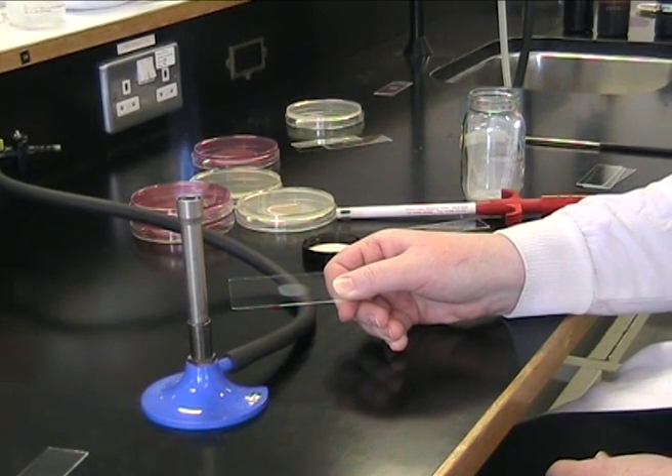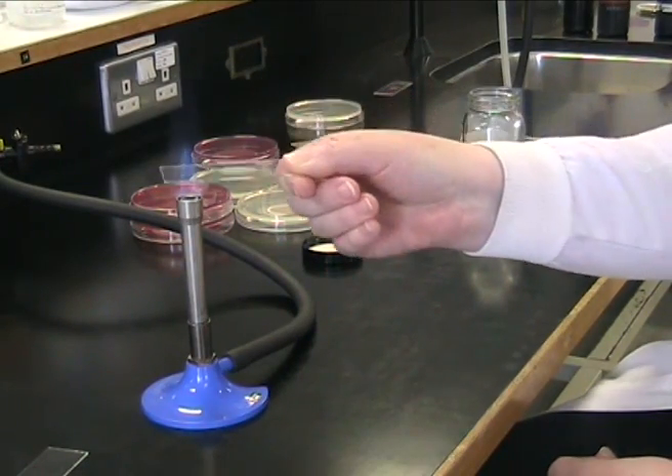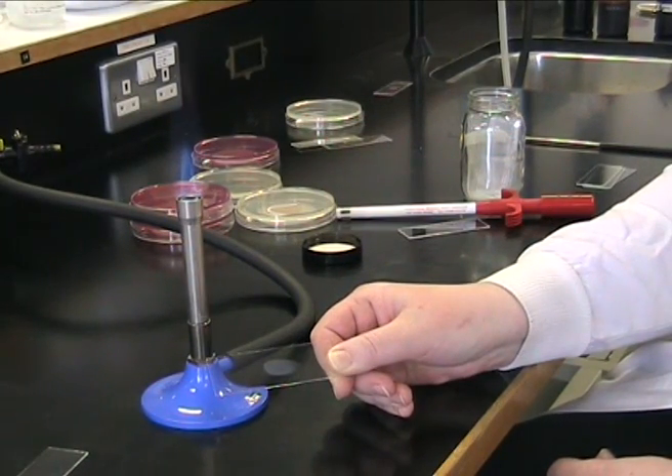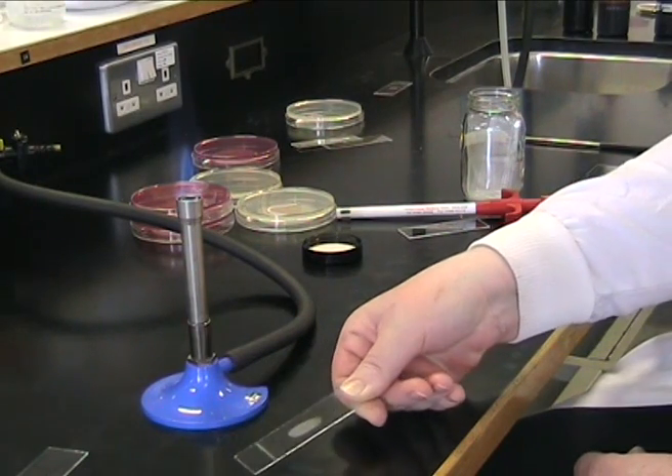Now we need to heat fix our air-dried slide. Take your slide and pass it three times quickly through the Bunsen flame. Be careful not to burn your fingers. The slide should not be overheated. It's now ready for Gram stain.